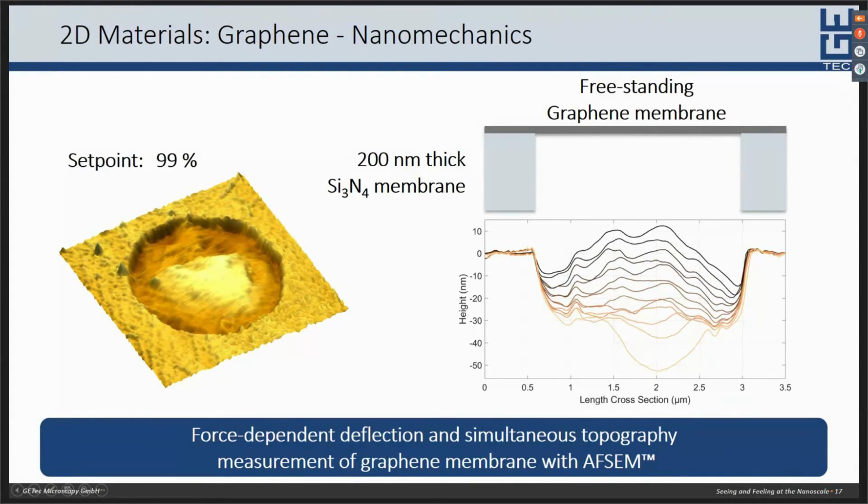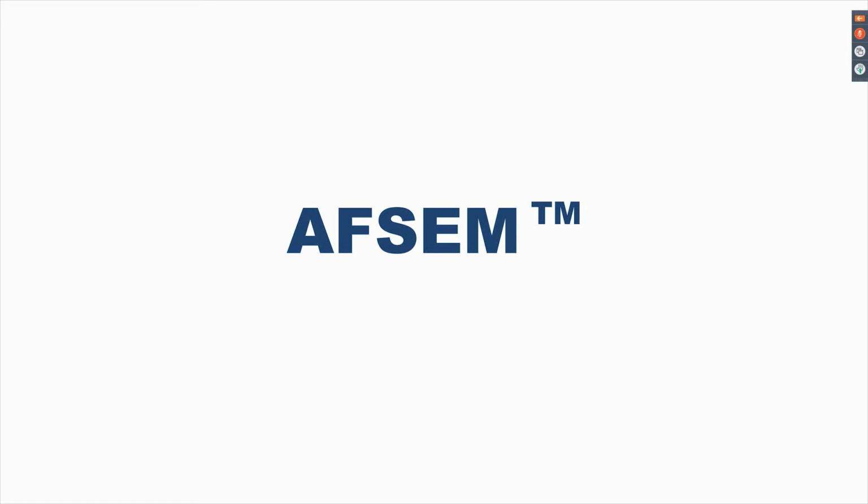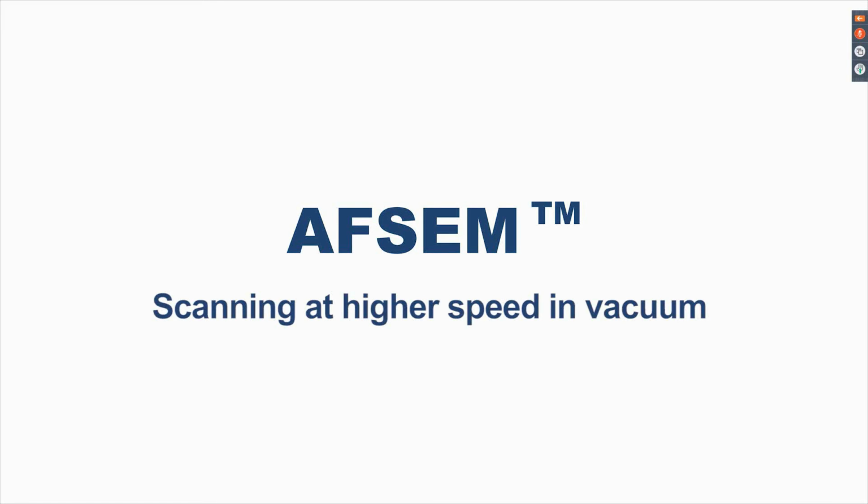Now, based on this series of measurements, we are often asked how long this analysis takes in the SEM, given the fact that the mechanical cantilever bandwidth is reduced due to higher Q factors of the cantilever in vacuum compared to air. At this point, I'd directly like to answer this question by showing you several measurements in the last video, which are presented in real time.